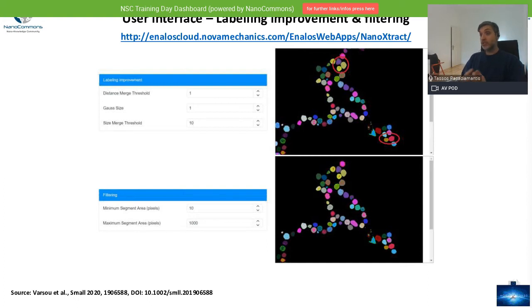I have to say here, of course, that what people need to keep in mind is that this tool is very subjective and based on experience. So it's based a lot on the human eye, like you would analyze an image manually, as people usually do until now, where you go in and identify and so on. It does all the calculations automatically, but it's based on experience. And each researcher using the tool may have a different approach and pick somewhat different parameters, in which case some deviation in the results is to be expected, which is the case in any case when we're talking about experimental data.